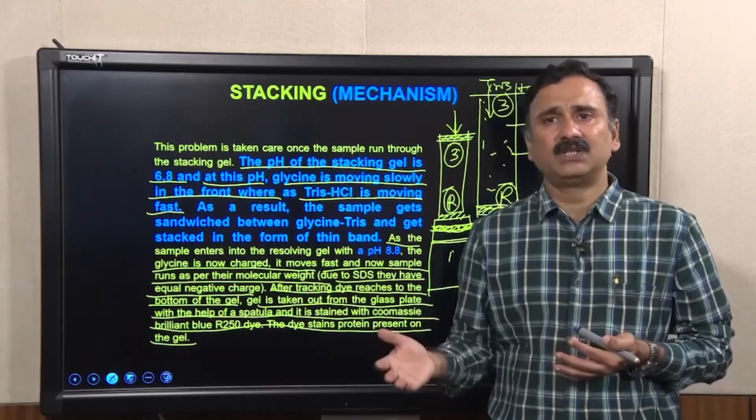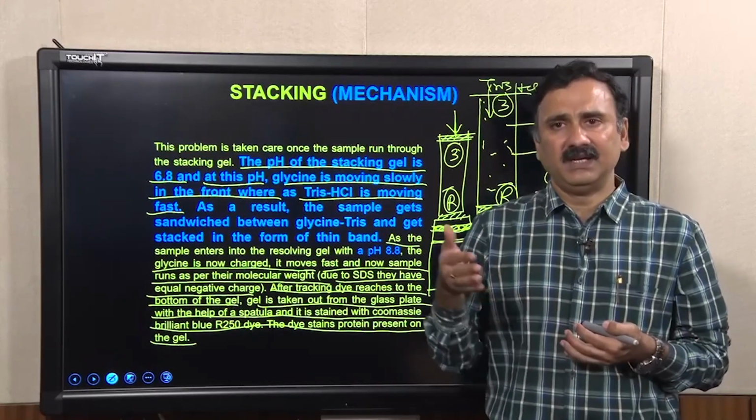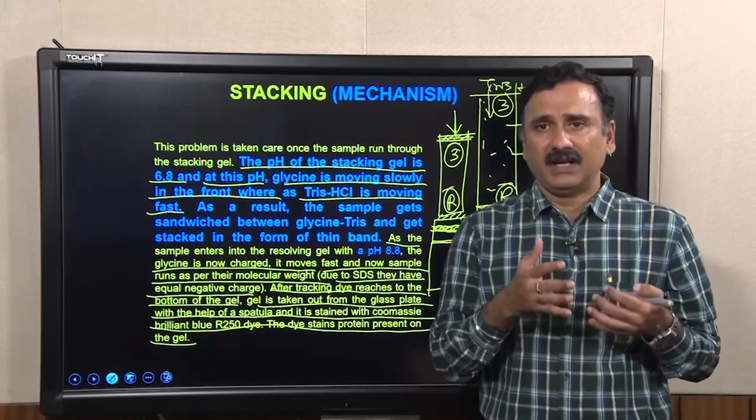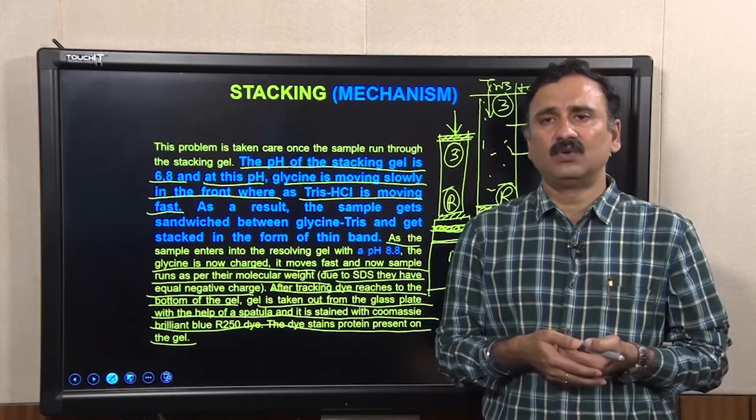In our subsequent lecture, we are going to discuss the imaging, the staining and destaining, and how to analyze the gel pictures that you are going to capture just after the electrophoresis.